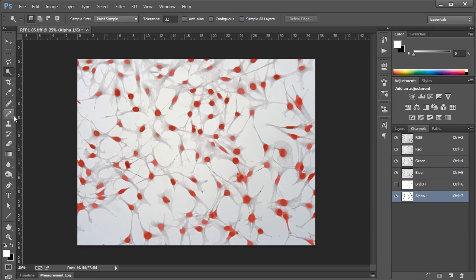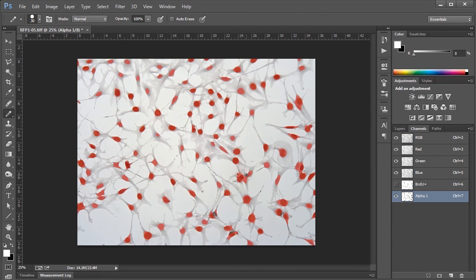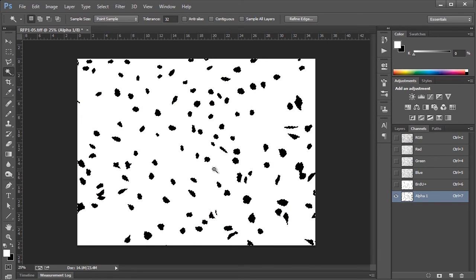So again, I'll go back, take my pencil tool, if I find some fused cells I'll try to break them apart, if I find some stray pixels on their own I'll erase them, but actually you know what, this looks pretty good to me. Maybe I'll split that guy up there. Yeah, great. So we'll close the visibility there. Again, we'll use the Magic Wand tool by clicking W. Select all of these again. There's some there, so let's go back and split that up. Yeah, that'll do.